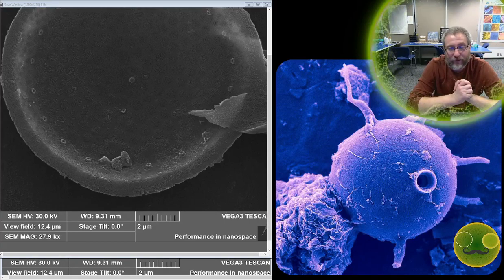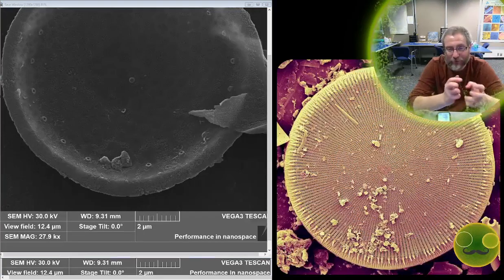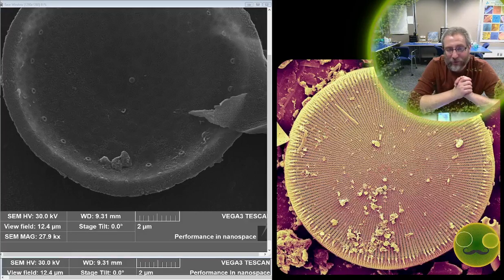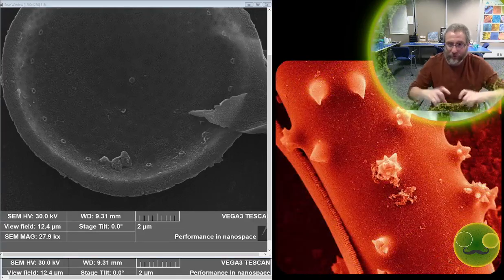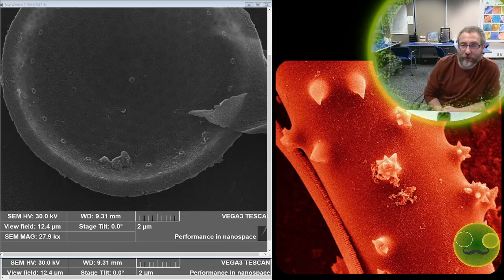And because the part that we got doesn't look very good, like there's not enough of the organisms, or something may have happened when we were processing them, so cleverly I always keep a little bit of it so that in case that happens we can double check, right, see what's going on. And then I don't have to bother the people who send me stuff with some more material. And in this case, we'll probably have to go back and take a look at some of the stuff from the original split that didn't get processed. So I'm going to do that, and I was planning on doing it today, and probably if I had just a little more time, I would have been able to get around to doing it.